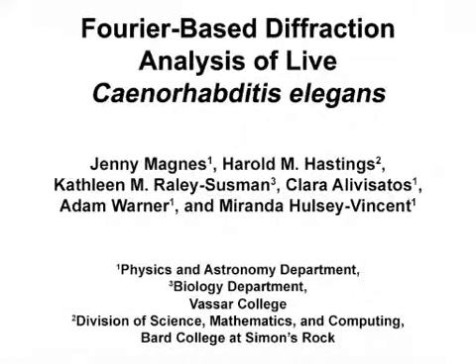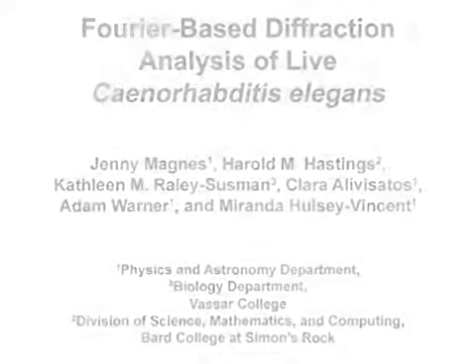The overall goal of this Fourier-based diffraction analysis is to characterize the locomotion of C. elegans in real time as the species moves freely in a three-dimensional space. This method can answer key questions in the field of neurobiology by describing species' responses to different densities of solution or locomotory mutants. This method serves as a baseline for Fourier analysis of microscopic species.